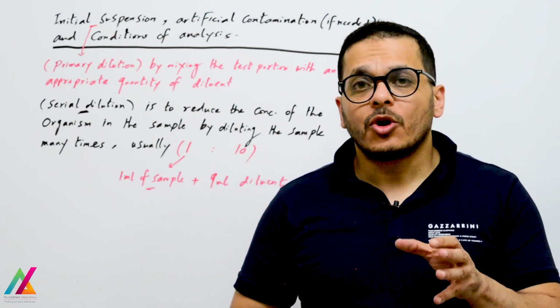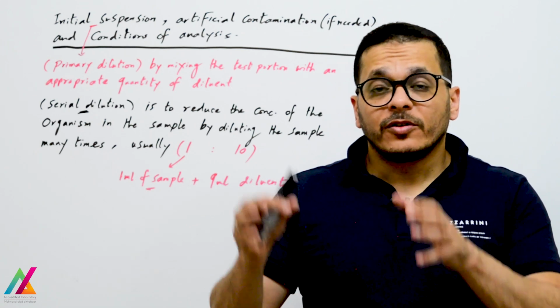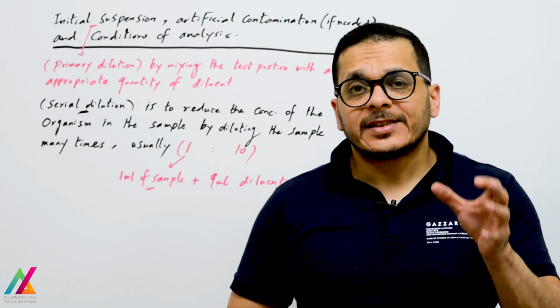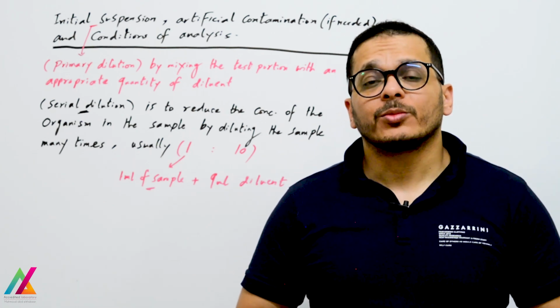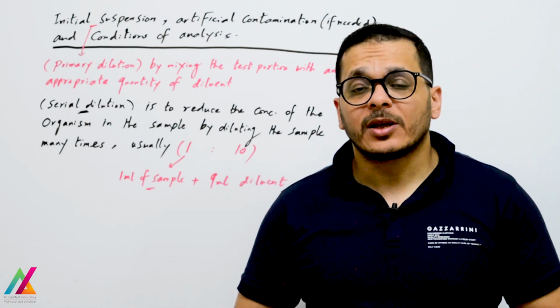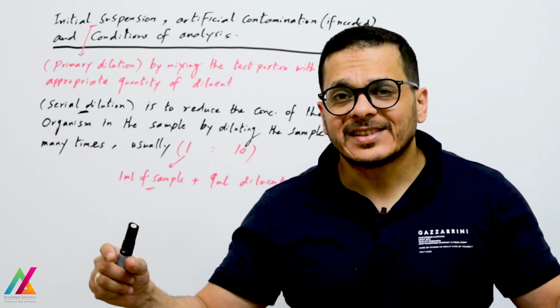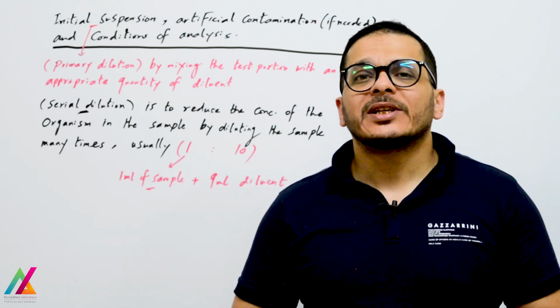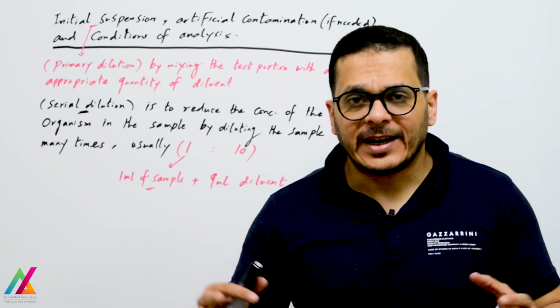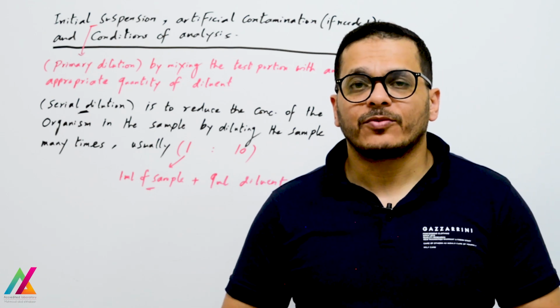I started with the microbiological measurement procedure by collecting the lab sample. At least 10 lab samples shall be collected for measurement uncertainty estimation. Then a test sample will be taken from the lab sample, which shall be homogenized well. Then at least 2 test portions shall be taken for analysis, to be analyzed by different analysts, or you can increase the number of test portions as I explained before.